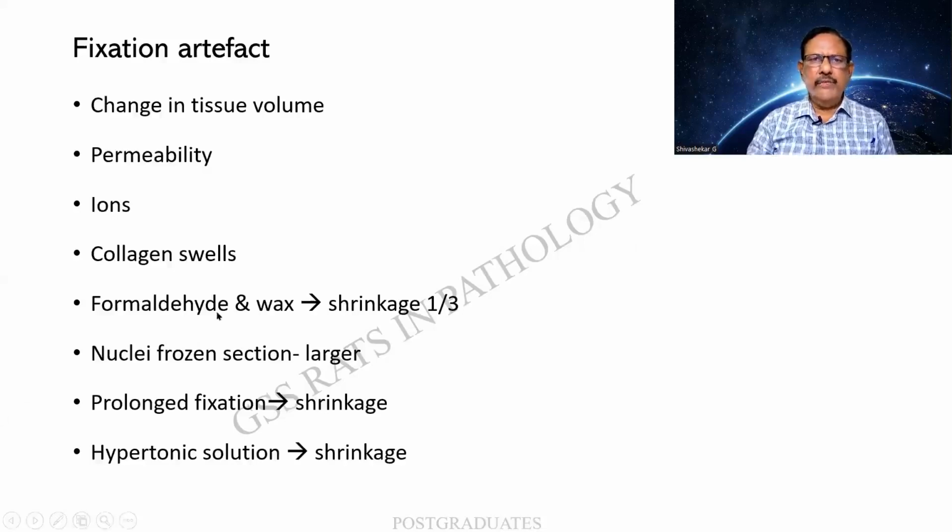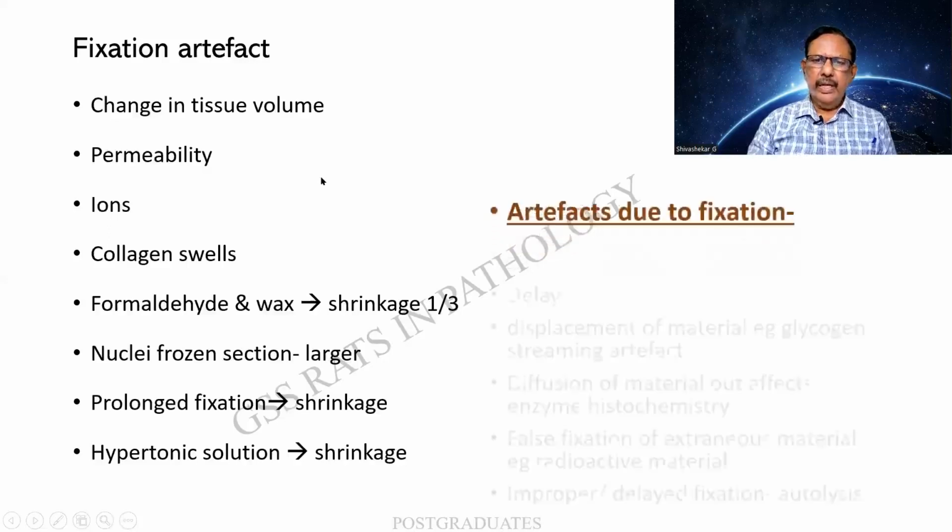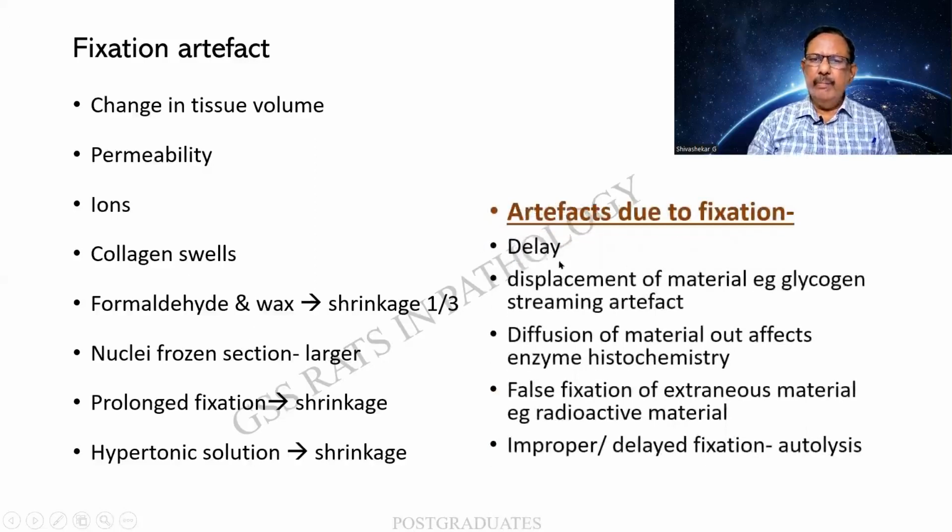It is not sufficient that we are a good pathologist. We should be a good histotechnician to some extent. The artifacts due to fixation can be because of delay. Many a time you find that the surgery has been done, but the tissue is not immediately transferred to the fixative. Displacement of the material, example, glycogen, etc., by means of this can lead to a streaming artifact.